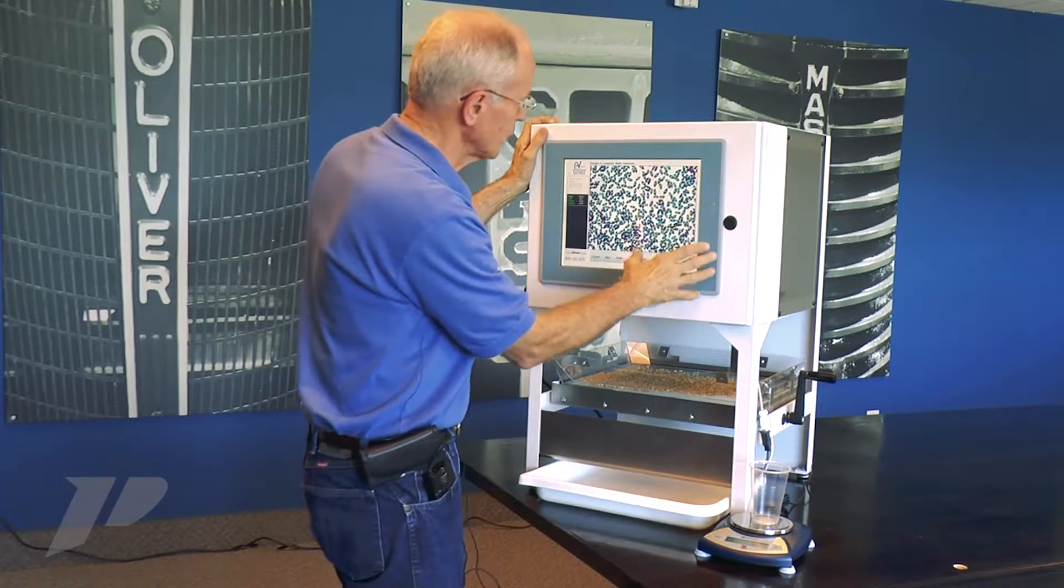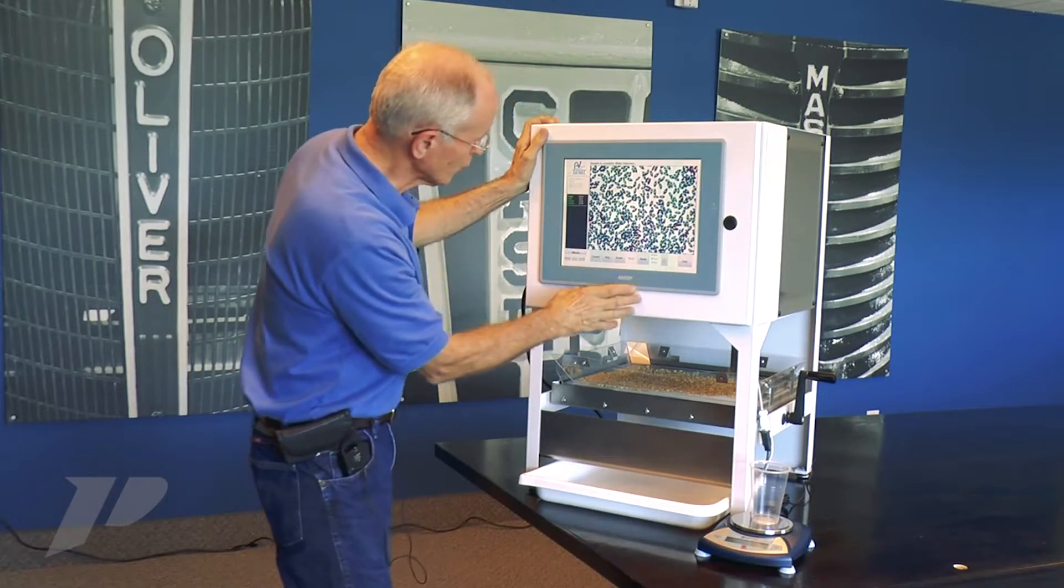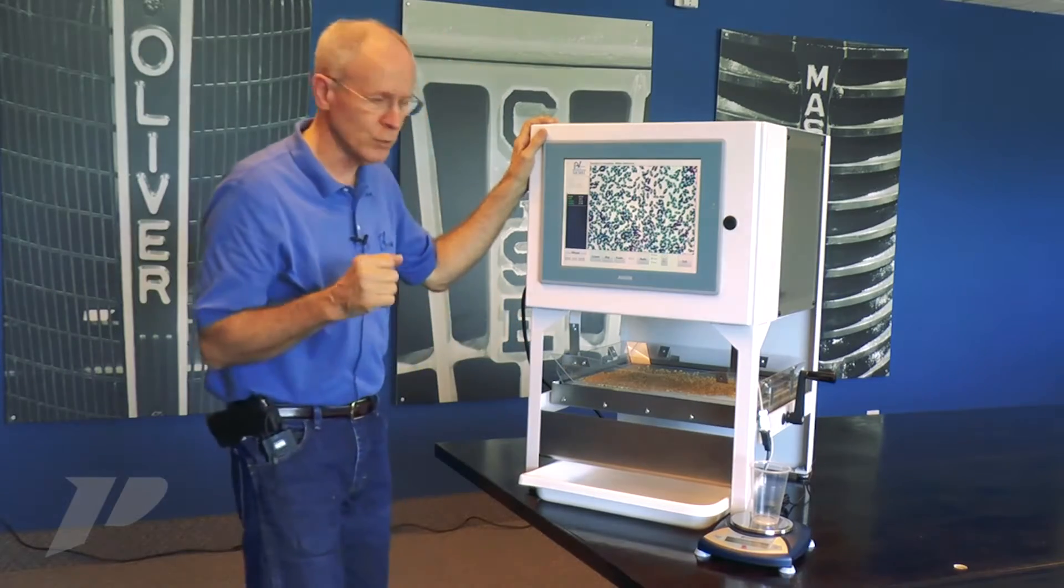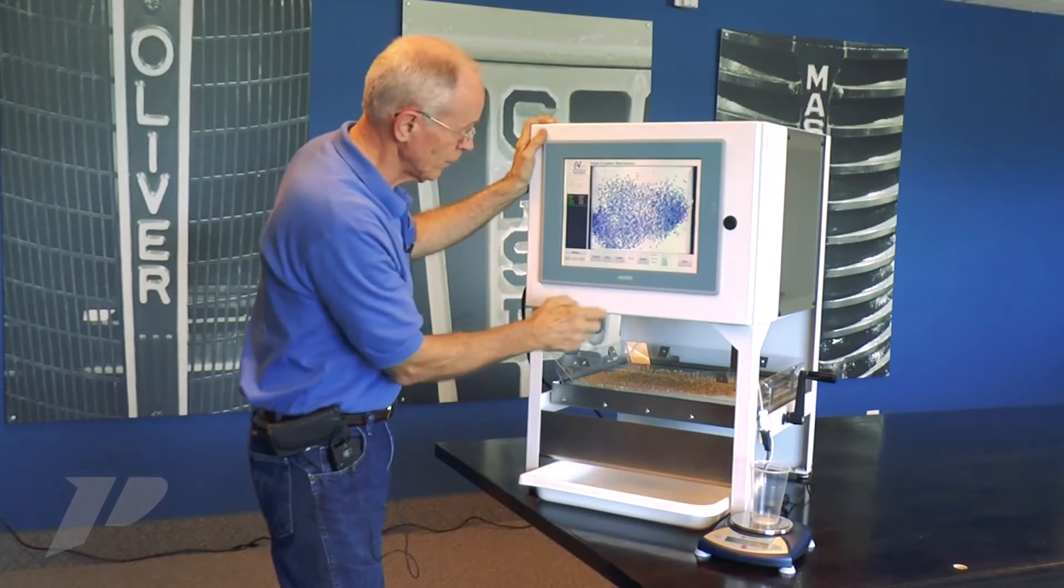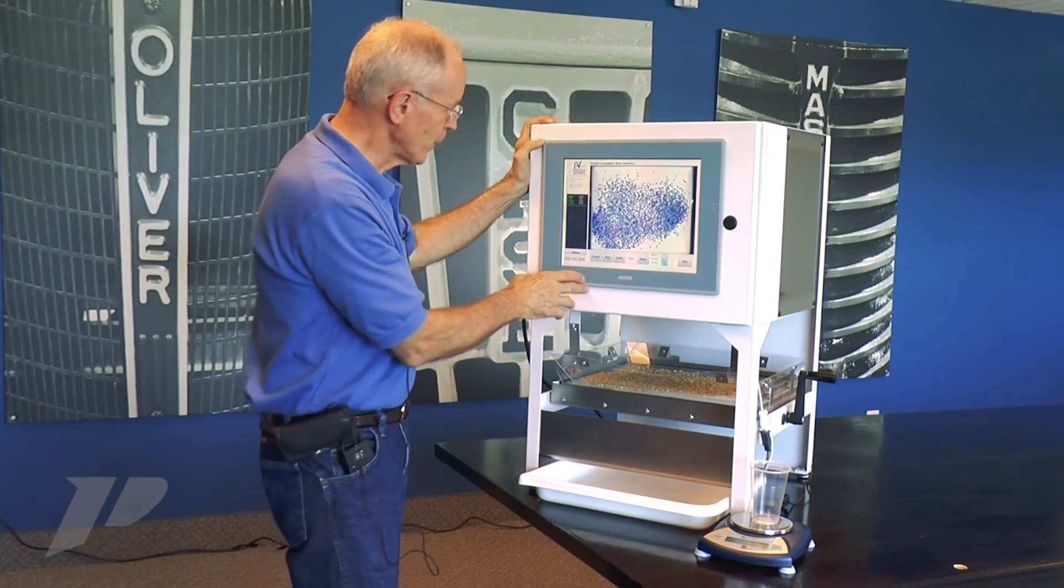I see two, two, two. I see all the yellows are twos. All the reds are three. I can be confident it's a good count, and then I can go back to reset view, and there's my image.